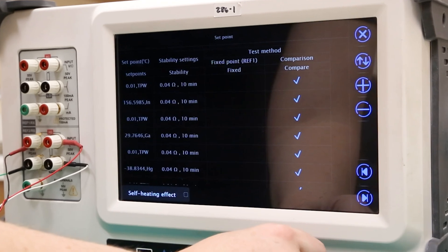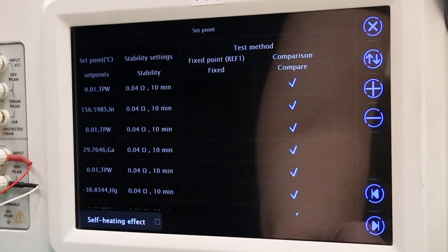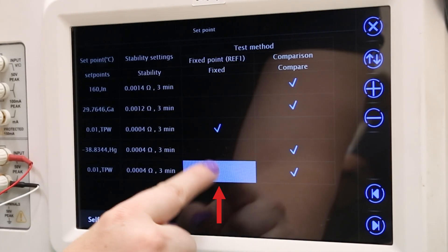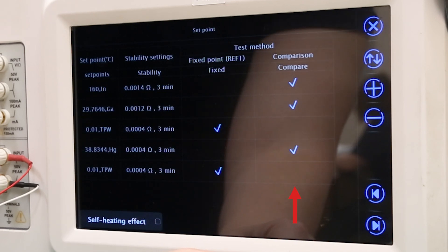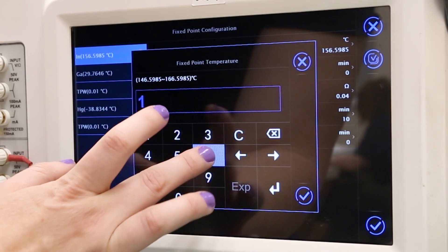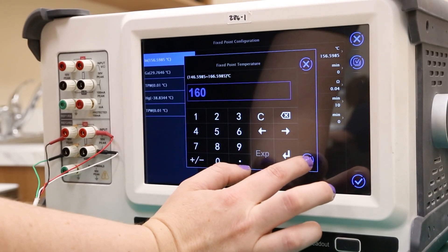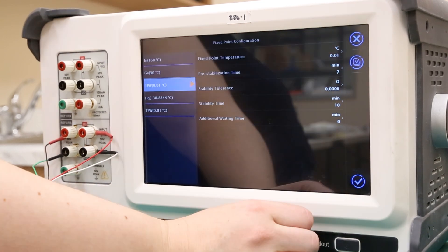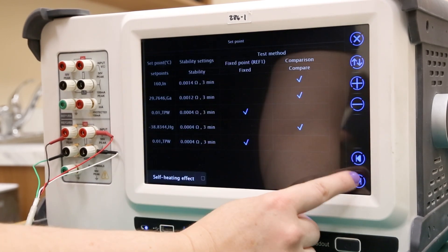Here the test method for each calibration point can be changed and points can be added or removed using the plus or minus keys. We will use fixed point tests for both triple point of water calibration points and comparison tests for the other three points. Specific test settings can be changed here as well by selecting the calibration point you wish to change parameters for. Once each point is configured to your lab's testing standards, press the next key.